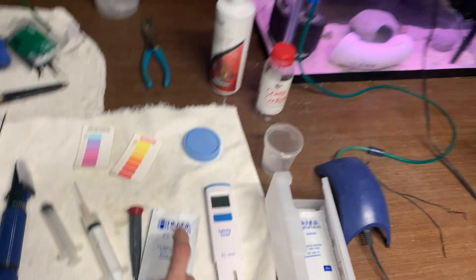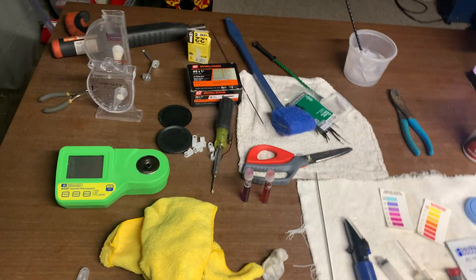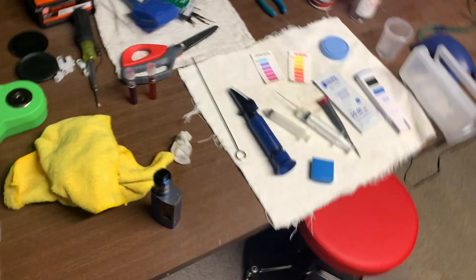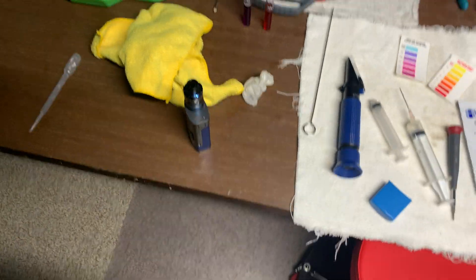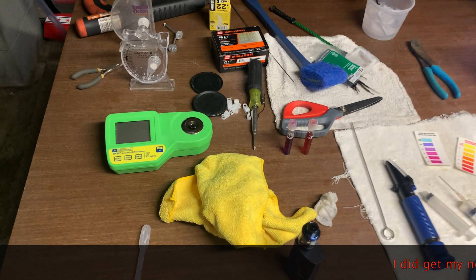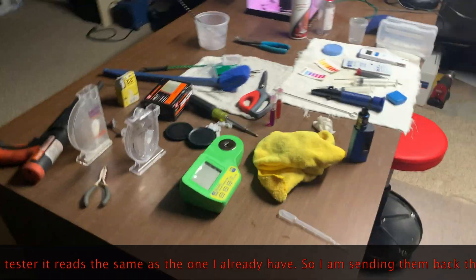I spoke with Hanna — the Hanna Instruments Company. They told me if it reads correctly when you dip it in the calibration fluid, then it's proper. I went to my fish store. They have a very expensive electronic one, and theirs read higher than what all mine read — I actually think his is off. His read 1.026 when this one was reading 1.022 and this one's 1.024. So I think the guy at the store was off a little. All I can tell you is I'm going to get another one of these in the mail and recheck it, because something's not right here.